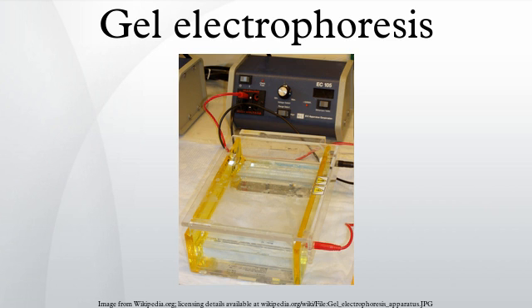Polyacrylamide gels are run in a vertical configuration while agarose gels are typically run horizontally in a submarine mode. They also differ in their casting methodology, as agarose sets thermally, while polyacrylamide forms in a chemical polymerization reaction. Agarose. Agarose gels are easily cast and handled compared to other matrices, because the gel setting is a physical rather than chemical change. Samples are also easily recovered. After the experiment is finished, the resulting gel can be stored in a plastic bag in a refrigerator.